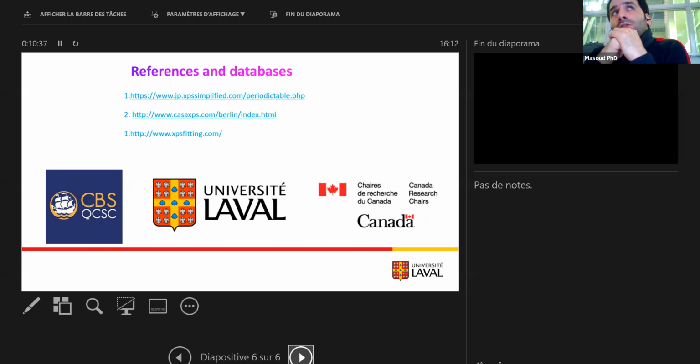You can also access several tutorials and information, with physical meaning and material science meaning, on the CasaXPS software, and it's also related to the licensing of the surface and so on.